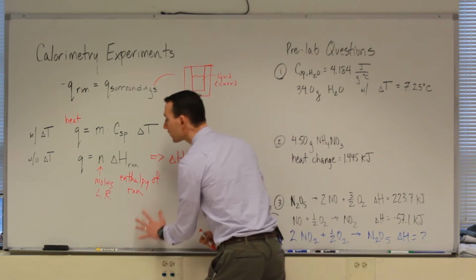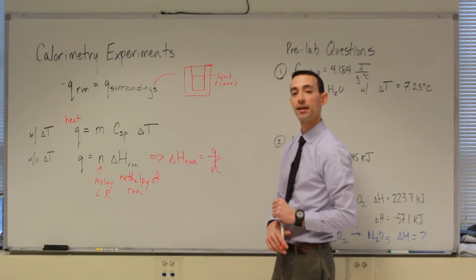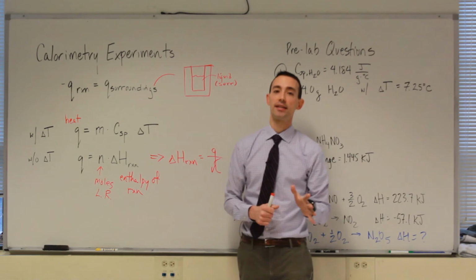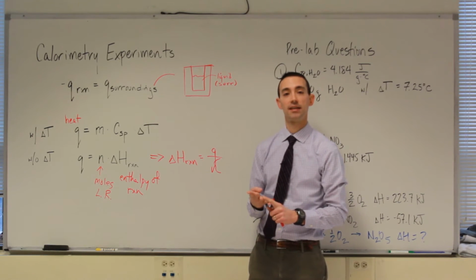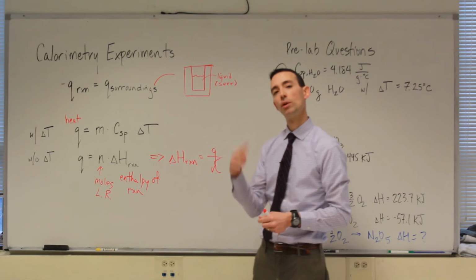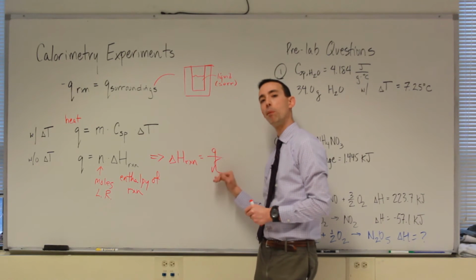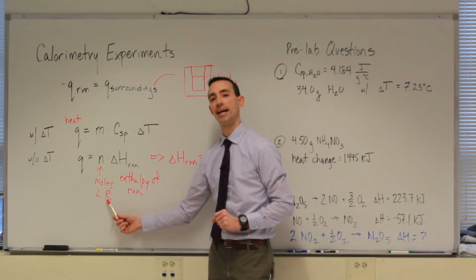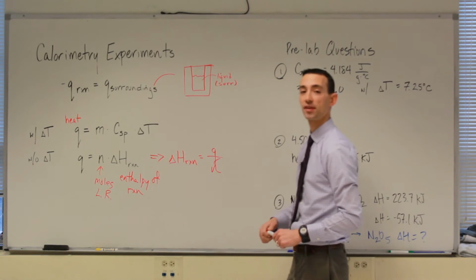And so you could study the 4 different chemical reactions equally, I should say, once you put your data into this format here. The reactions today all involve hydrochloric acid with a different solid. The 4 solids are going to be magnesium, magnesium oxide, zinc, and zinc oxide. So 2 pure metals, magnesium and zinc, and then 2 oxides of those metals. And in this group of 4, when we're all done, we'd like to compare how much energy is being released per mole of the solid. So the solid is going to be set up in all of our cases to be that limiting reactant that you'll use in this equation here as part of your calculations after lab today. Okay.